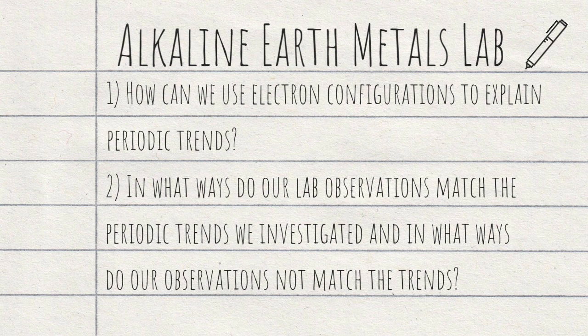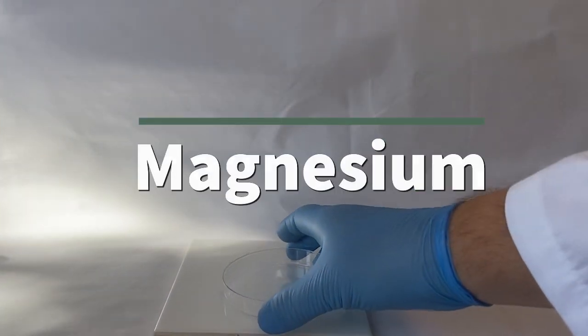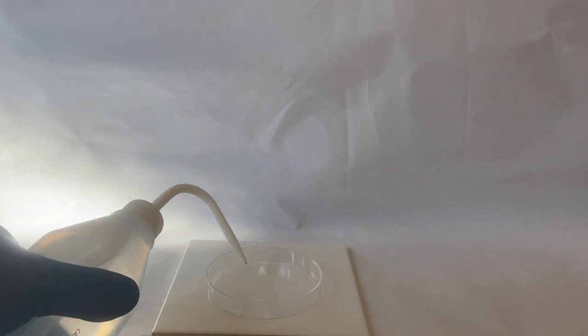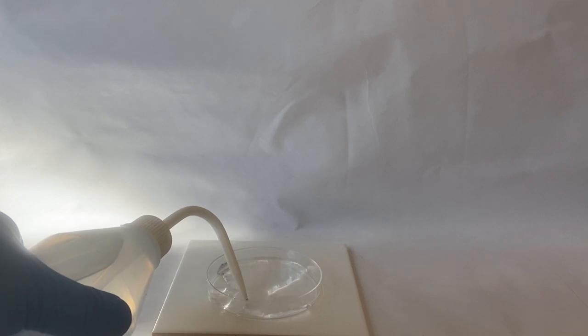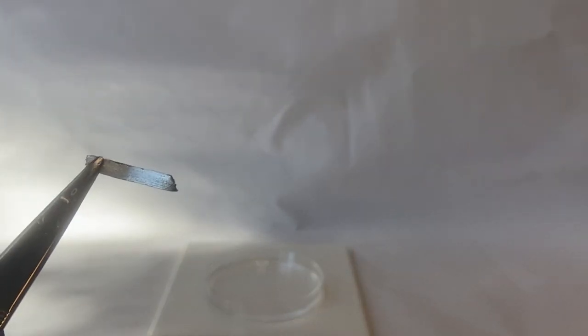Enjoy the reactions and the music. First up is magnesium. I'm going to fill the petri dish with distilled water. Here's the magnesium ribbon that we will add to our petri dish with distilled water.